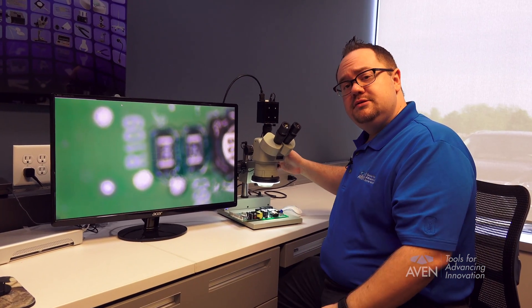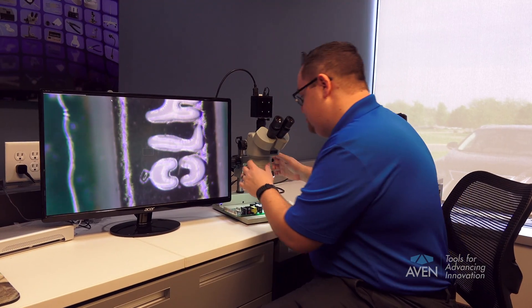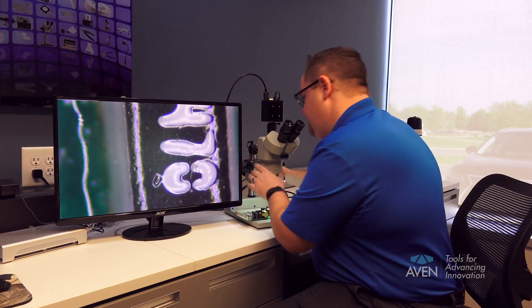Okay, first step: take your stereo microscope and move it all the way to the highest possible magnification, then adjust the objective so your eyepieces are in focus. Next, move the microscope back to the lowest magnification.